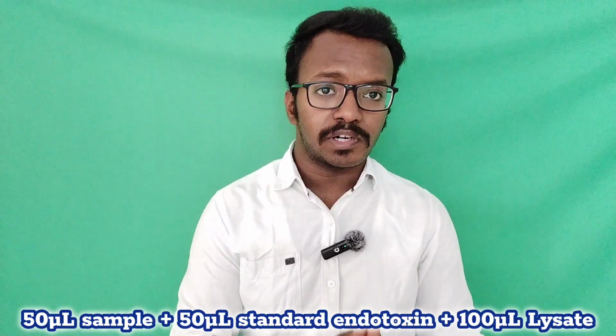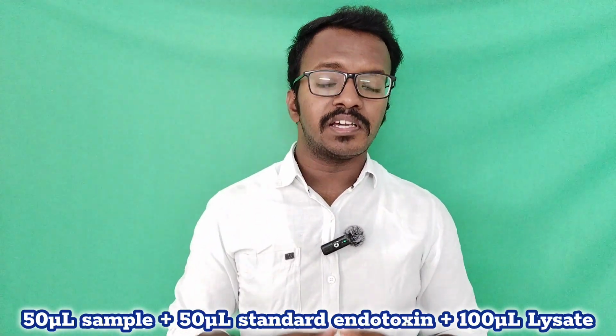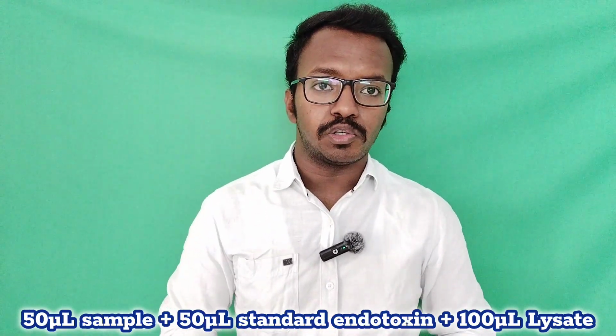So this is our sample. Now transfer all the samples individually to individual test tubes, 50 microliters each. Then the same amount of endotoxin is also added. Finally, 100 microliters of lysate is added into the tubes and they are kept in incubation at 37 degrees Celsius. I explained this process within 20 to 30 seconds, but it is a very big sample preparation.